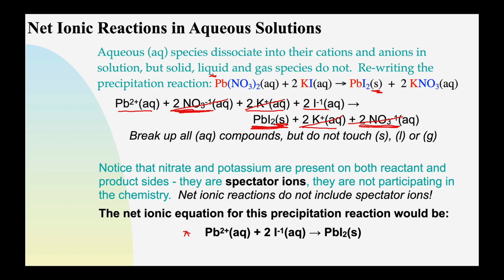So as an example of what I mean, maybe we look and we find we have sodium iodide, NaI. And NaI in water is also aqueous. So if we add NaI instead of KI, you're still going to have the formation of the PbI2. We've just flipped spectators from K+ to Na+. This is a really neat thing for chemists to do. It allows you to be a little flexible in how you do your chemical reactions.